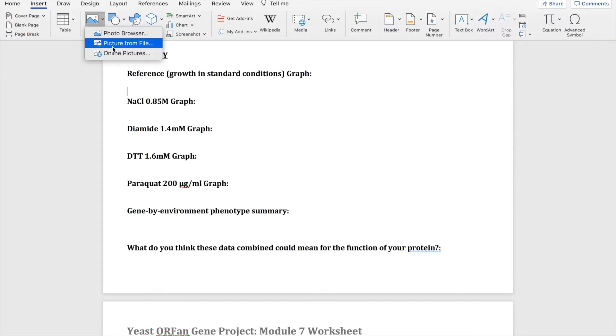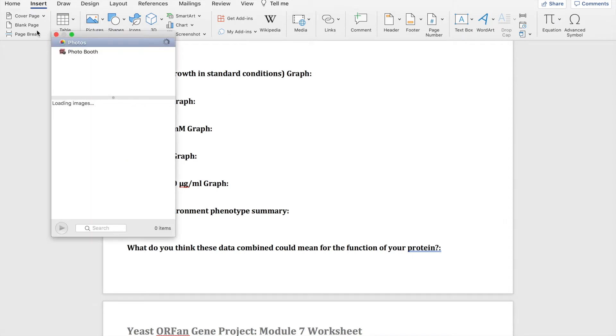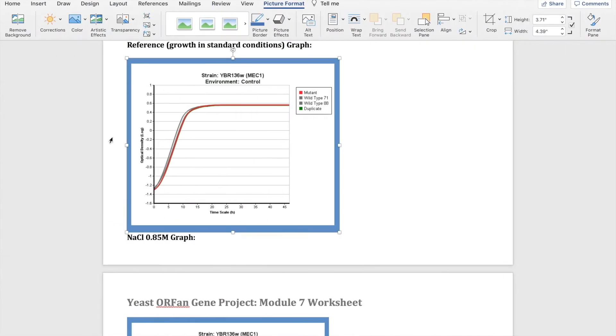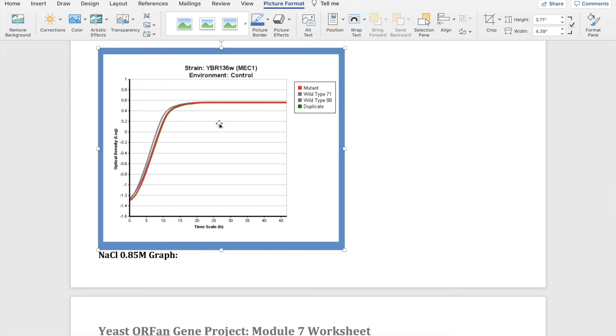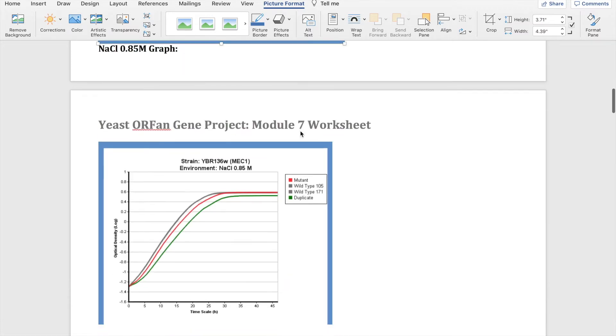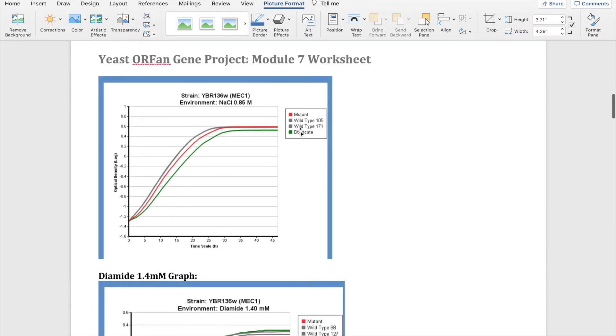I am going to paste all of the graphs here. We're going to start by analyzing the graph. We have our mutant in red so that has your gene knocked out so it will not be making that protein. We have the duplicate in green and the two wild types, and as you can see with the control they mostly line up so they have the same growth density on the plate over time.